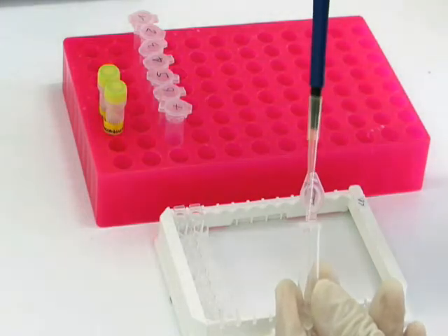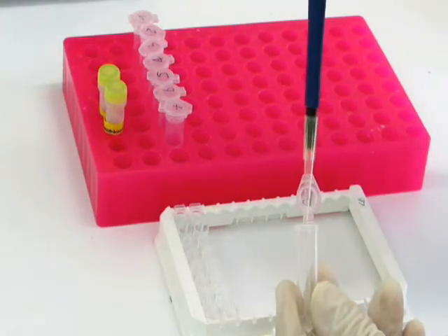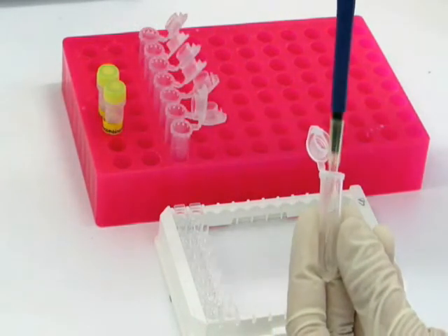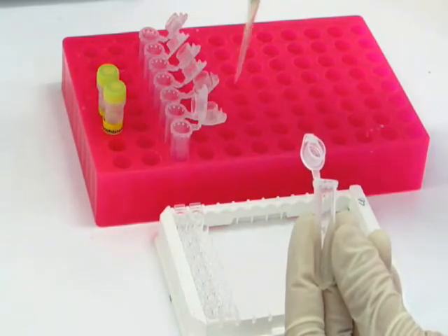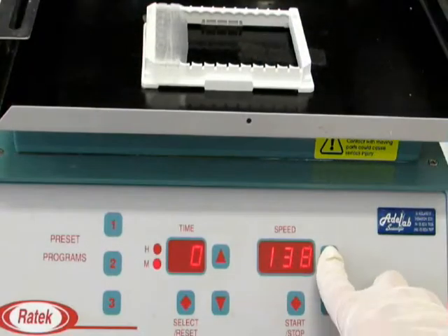Add 100 microliters of diluted standards, samples, or blanks to the pre-coated microplate wells. Seal the plate and incubate on a shaker at 140 rpm for the time indicated in the kit protocol.